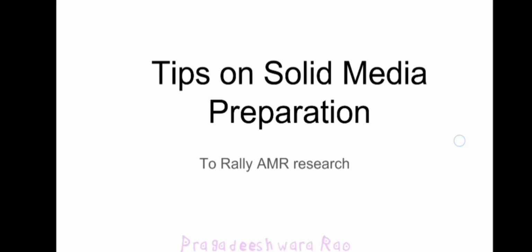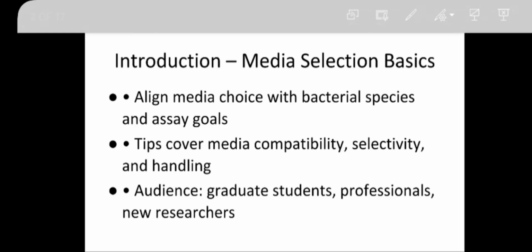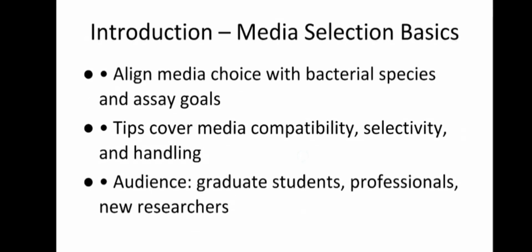Hi, this series will be focusing on preparation of solid media, specifically for the purpose of bacterial culture and testing. Selecting appropriate culture media is critical because we'll be testing varied species of bacterium. Some bacteria prefer special media for their growth, whereas some will grow in anything.